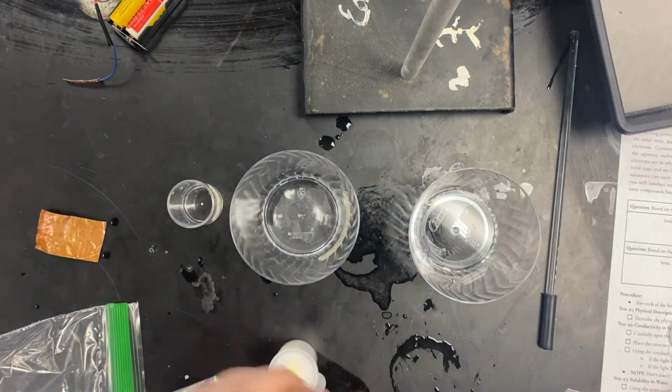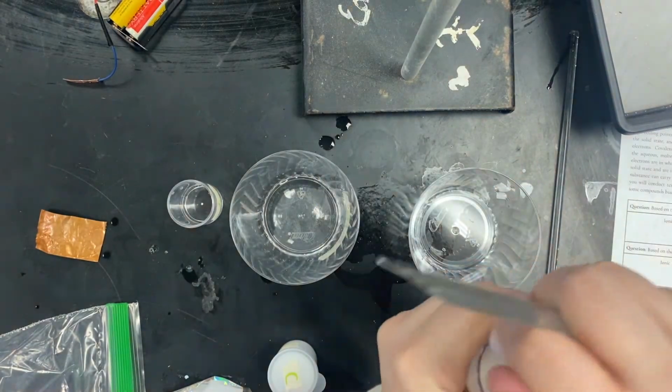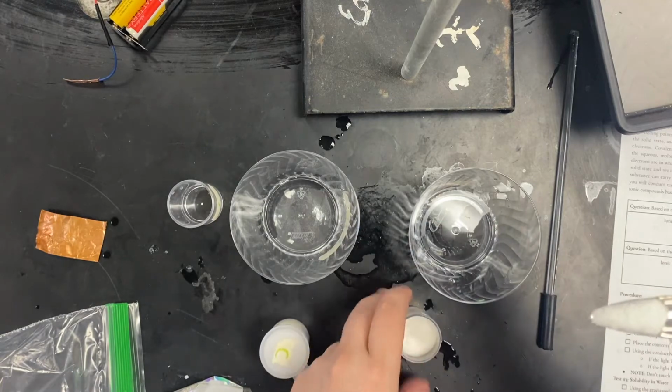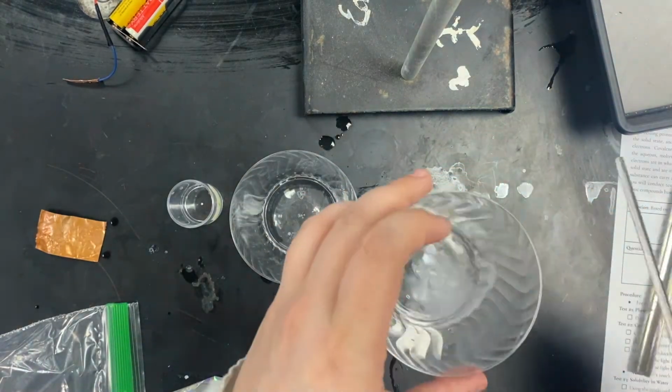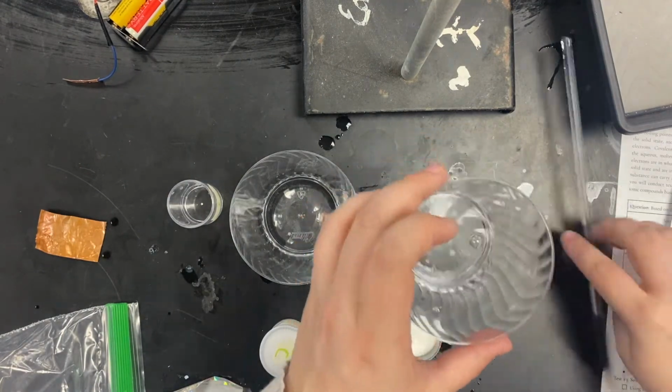When you're done with that, you'll do the same thing with B. Again, open it up. Take a small scoop and throw it into the cup labeled B. Throw it in there and do some stirring.